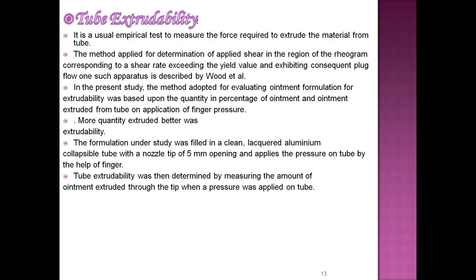Then another one is the tube extrudability. How much amount of ointment will come out from the tube? It is a usual empirical test to measure the force required to extrude the material from the tube. The material here is the ointment.